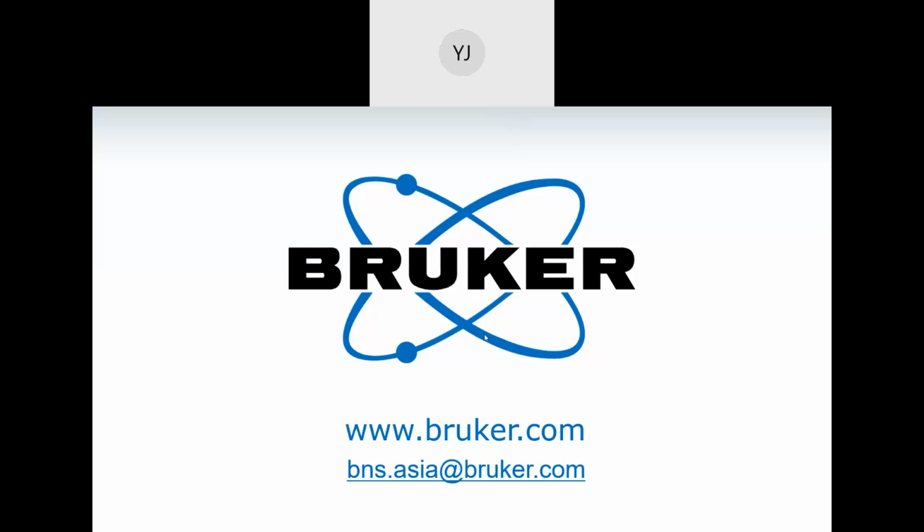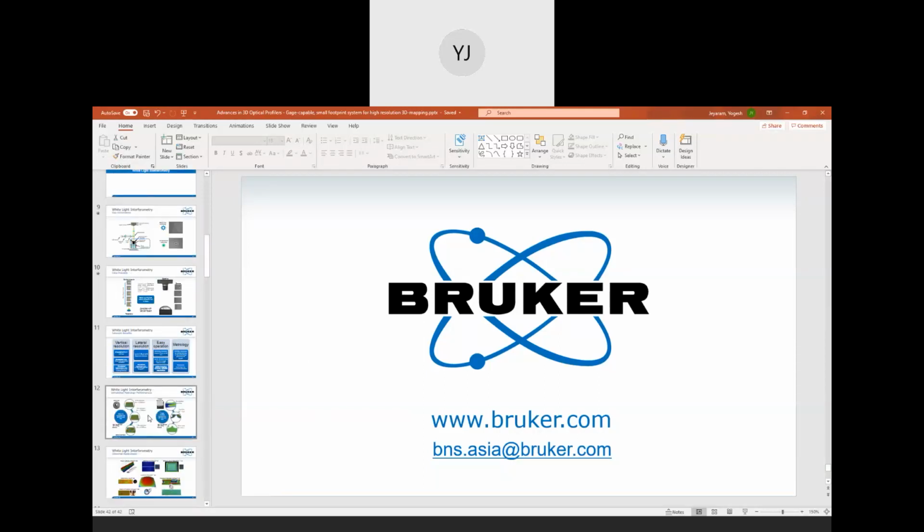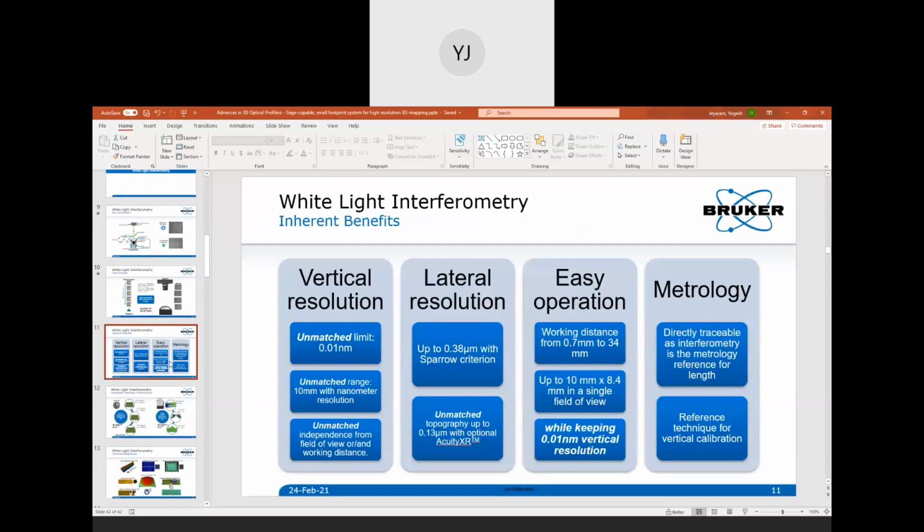One of the questions that I received is, what's the optimal objective to use for measurements? This is a good question. Let me see if I can show you the data here.